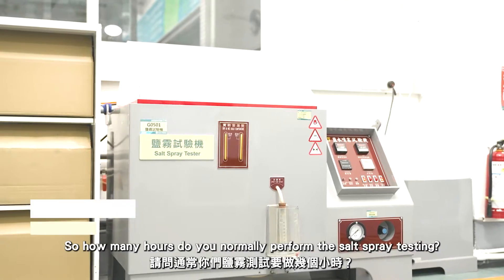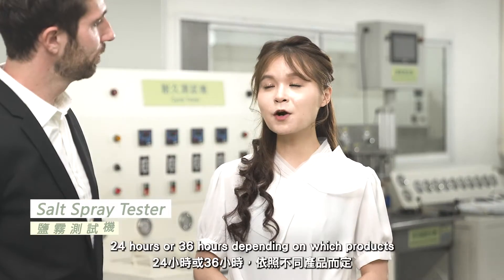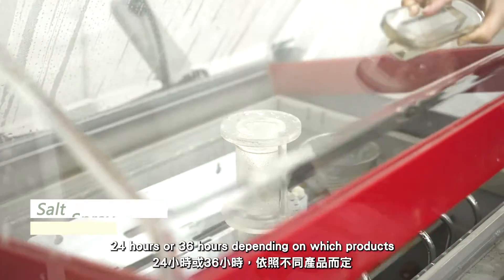So how many hours do you normally perform with salt spray testing? 24 hours or 36 hours, depending on which products.